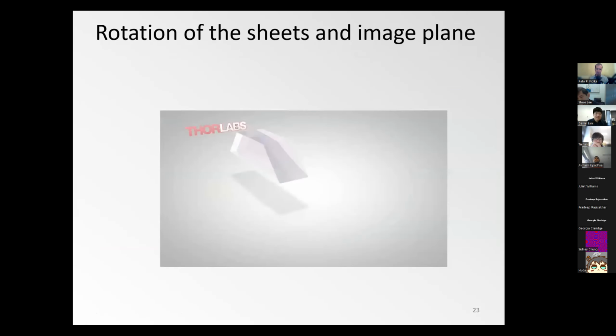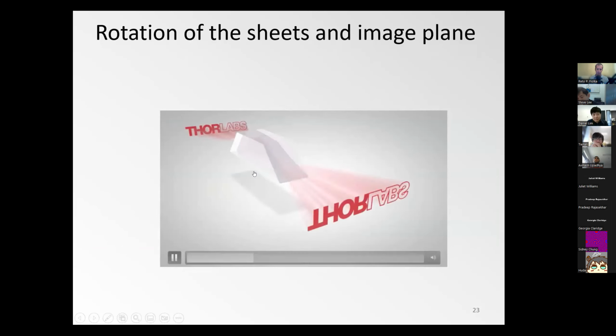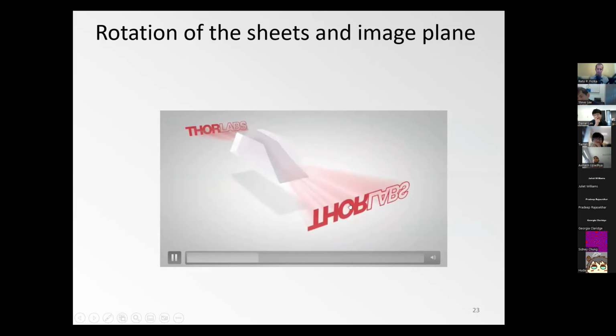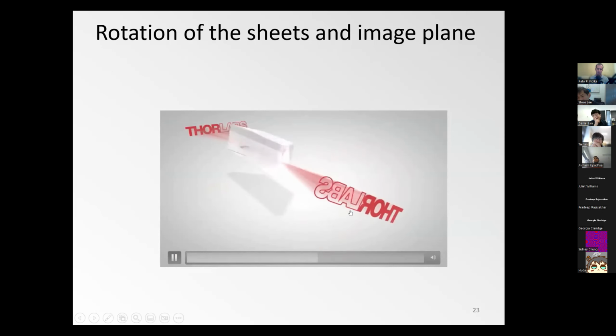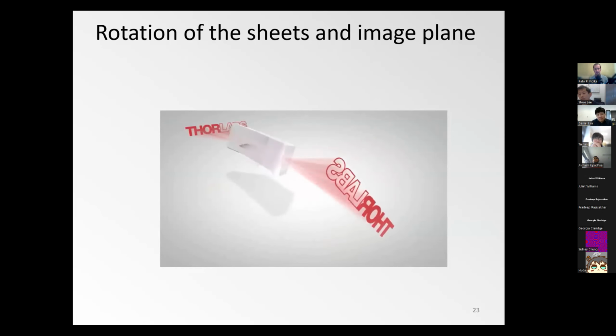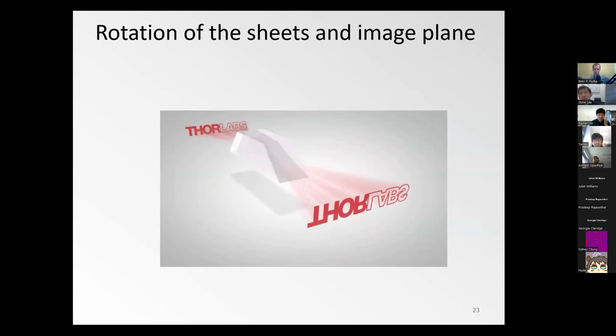So what we came up with is actually looking into optical elements that can rotate an image. One is this Dove prism. And as you can see, if it rotates, it actually rotates the image by twice the rotation angle, and also has a bias rotation. So even if it's not rotated, it rotates the image by 180 degrees. So such an element you could actually buy from Thorlabs. You could put it into the microscope and rotate it, and you could rotate both the excitation and, if you want, also rotate the image so that it always lines up as you would wish.